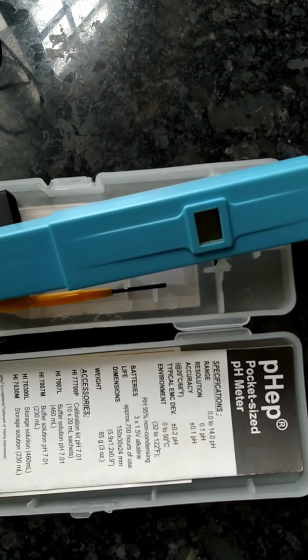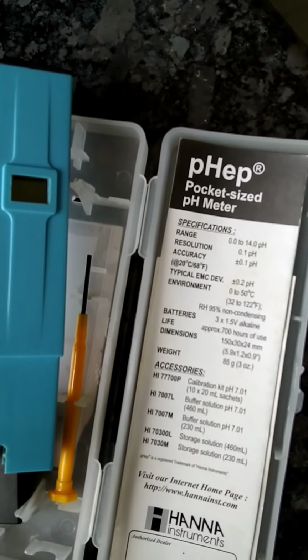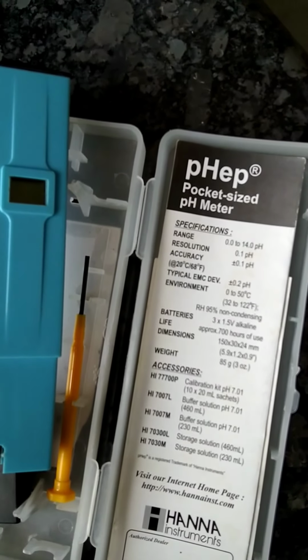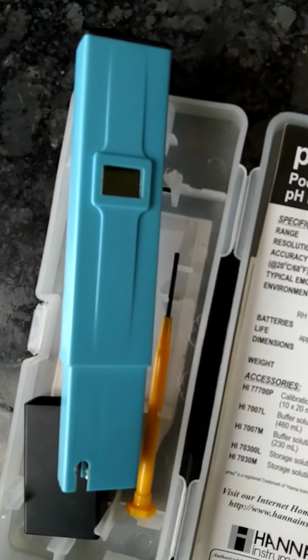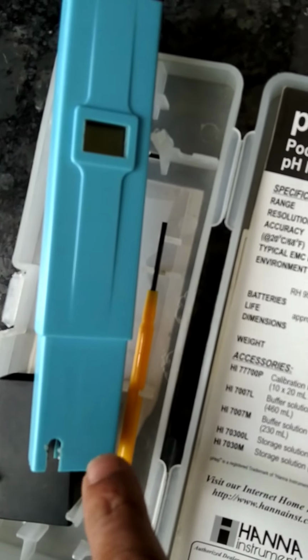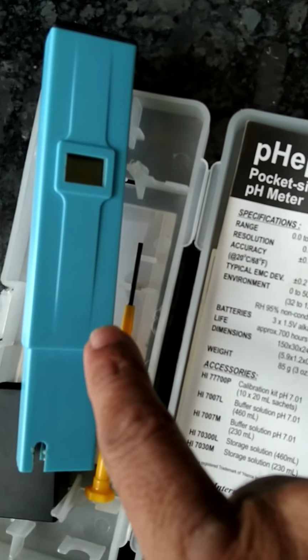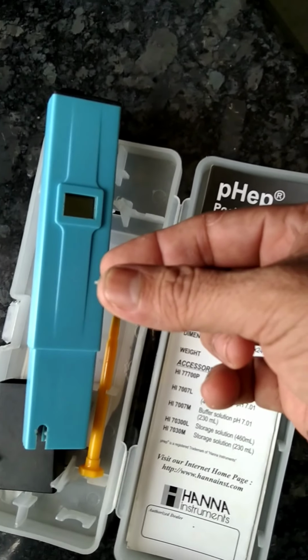So especially this instrument is used for detection of quality in terms of pH, negative log of potential of H plus ions of the solutions. How much of the potential H plus ions are present in the solutions, whether it is acidic or basic, that can be decided on the basis of pH. So using this pen pH meter we can determine the pH of the solution. Here a glass type of electrode is present that is attached to the electronic circuit in this instrument. It is a handy, simple instrument, the pen pH meter.